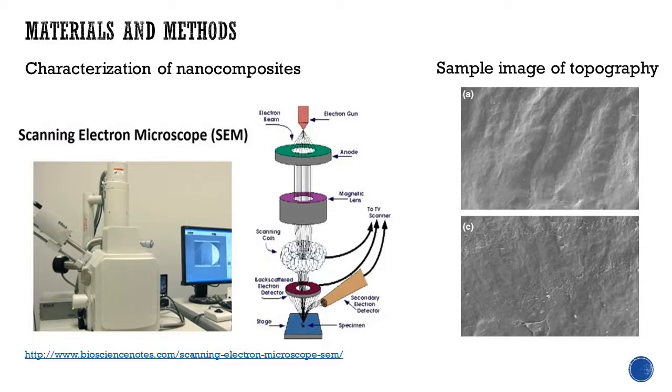A sample image of the SEM analysis is shown. SEM was used for the analysis of fracture surfaces of the membranes and for the analysis of the tubular prosthesis.